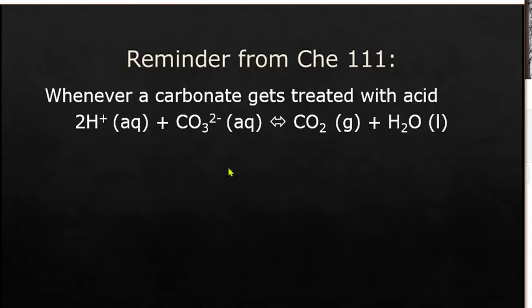It's also a little test they do if you have minerals that have carbonates in them. They sometimes just drop acid on the rock, and the rock will start gassing off the carbon dioxide. All right, so now we're ready. We're set up, and we're going to let the technician show us how to do Le Chatelier's principle.